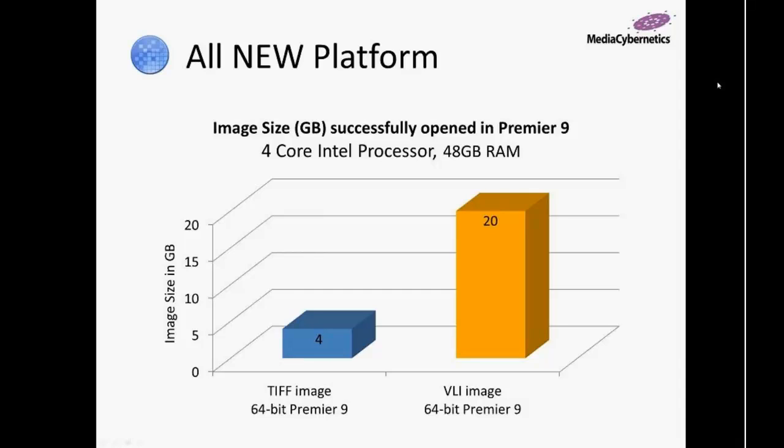We have a few more of those to talk to you about today, but at the moment we're easily supporting the objective imaging file formats and the Aperio file formats. These innovative new file formats have made a difference for all of us. You're allowed to open these images, you can crop out sections, you can navigate quickly and easily, and it's all made possible by a pyramidal file format that allows you to look at a thumbnail version of the larger image when you're zoomed all the way out, and the high-resolution version of that exact same image when you zoom all the way in.